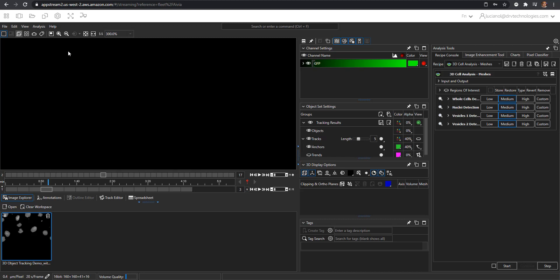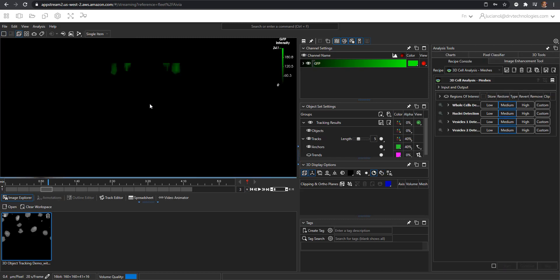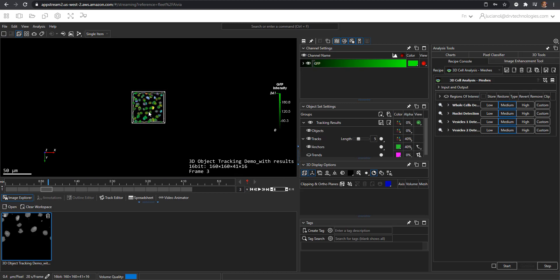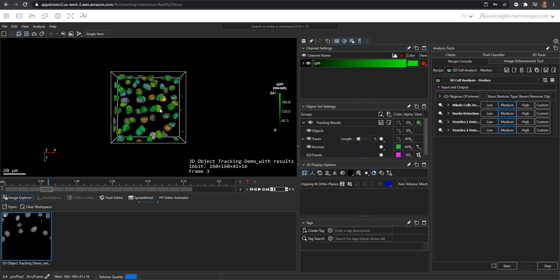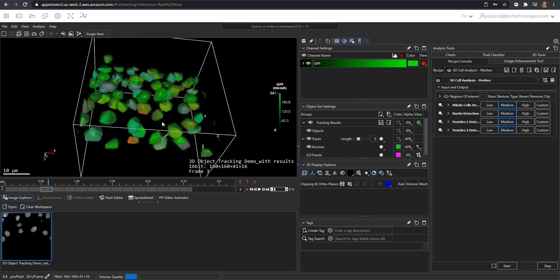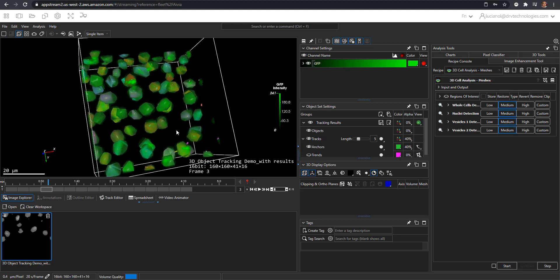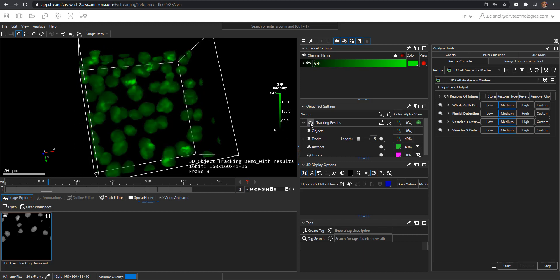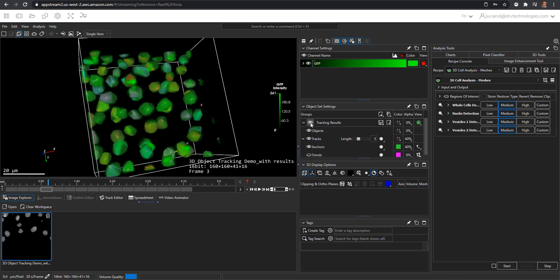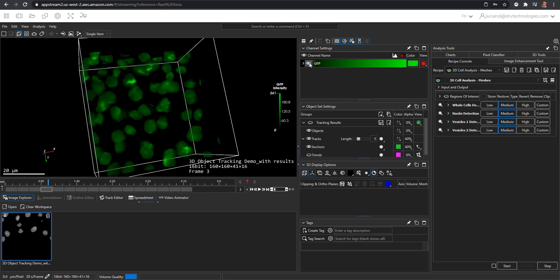In the 3D view you will see this 3D dataset with both the results which can be turned on and off under the object set settings, and the raw data which can be turned on and off in the channel settings.